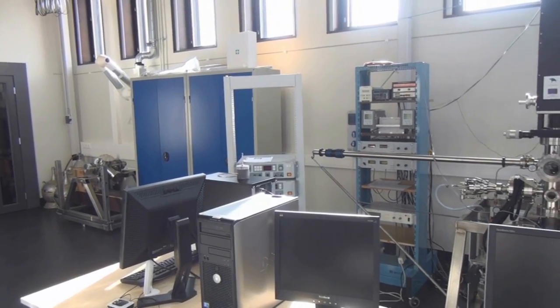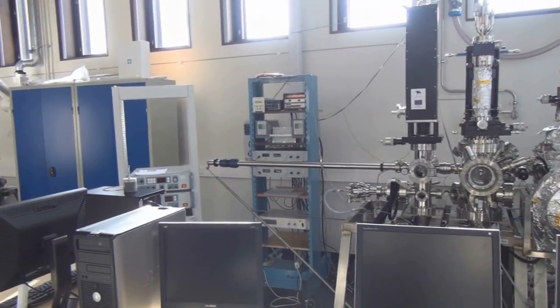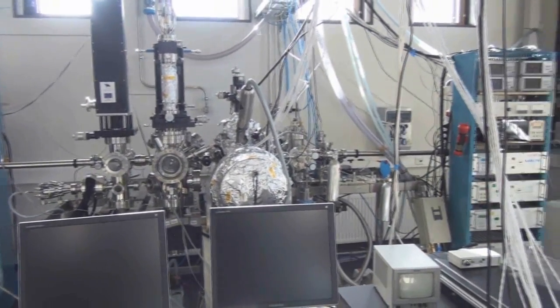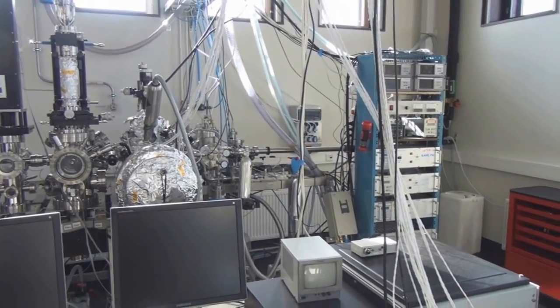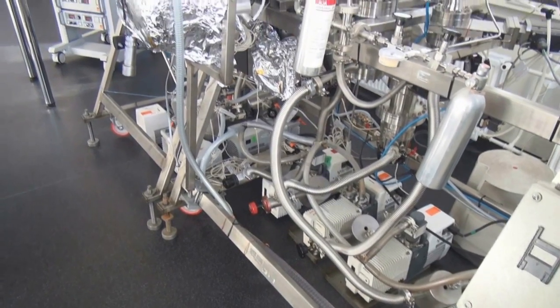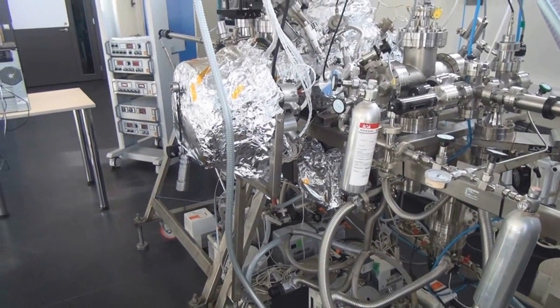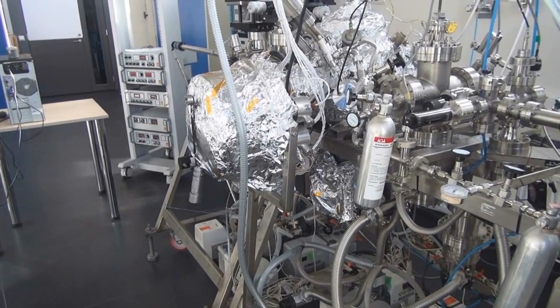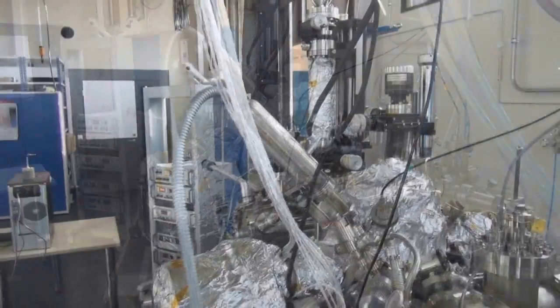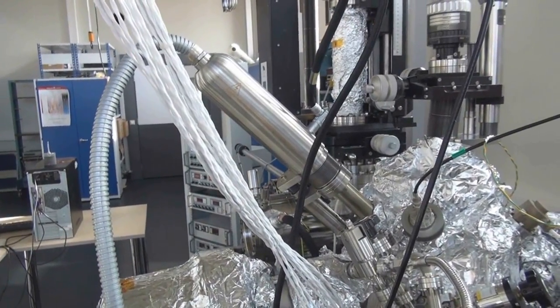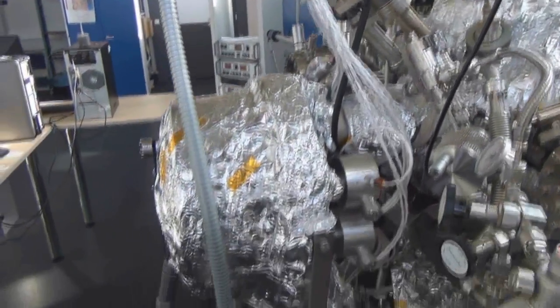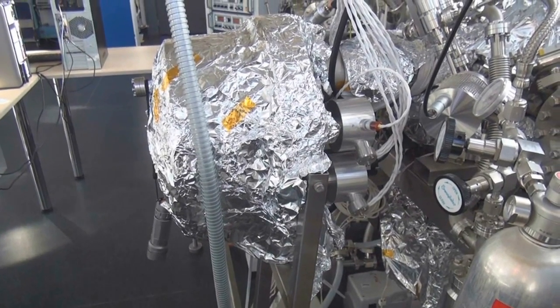Now this marvelous piece of engineering is a real X-ray photoelectron spectrometer used for surface studies in the Institute of Physics in the University of Tartu. It operates in ultra-high vacuum of 10 to the power minus 10 millibar, which is obtained by combining oil-based rotary pre-vacuum pumps, a turbomolecular high vacuum pump, and finally an ion pump for ultra-high vacuum. Here is the X-ray tube where the exciting radiation is generated, and here is the hemispheric electron energy analyzer.